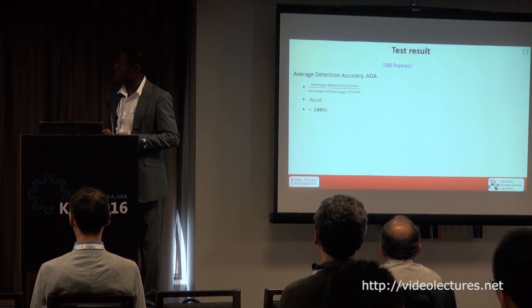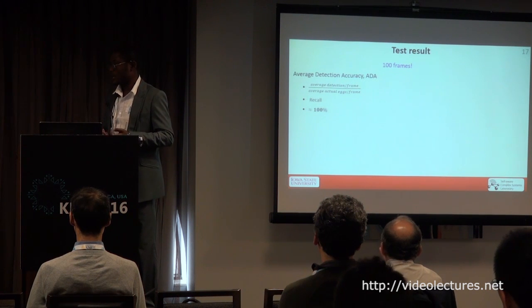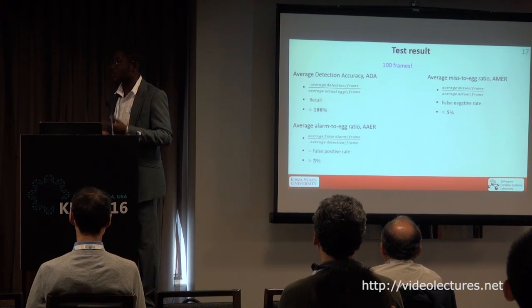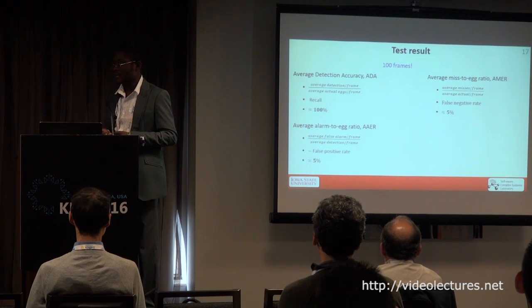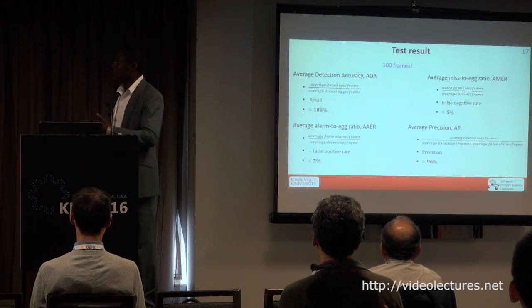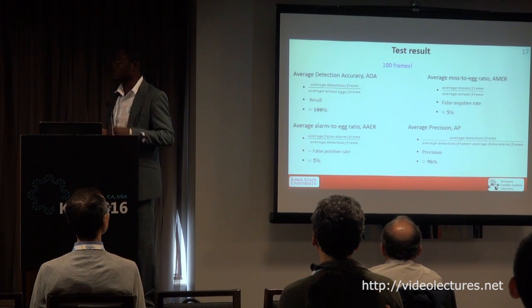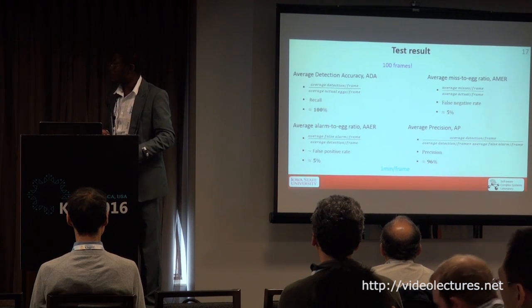In 100 frames, the analysis is that the algorithm is able to recall 100%, but maybe that would be explained by the next point here, that the false alarm rate is almost equivalent to the misses as well. So then its recall is 100%. And farmers are interested in the 100% because basically that shows that they don't apply more or less pest control. While from the algorithm standpoint, we're more interested in how precise our algorithm is. So we still find that our algorithm is 96% precise. And so it still needs to be improved upon, basically. And the frame rate is also shown on the bottom.